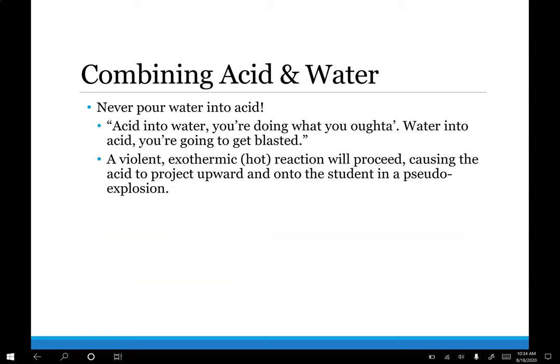When combining acid and water, we never pour water into acid. The reason is that it causes a violent exothermic reaction, especially with concentrated acid, similar to a pseudo explosion — the hot molecules project upward onto the student. The phrase to remember is: 'acid into water, you're doing what you ought to; water into acid, you're going to get blasted.' The biggest risk is not just heat burns but that it will project upward toward you.